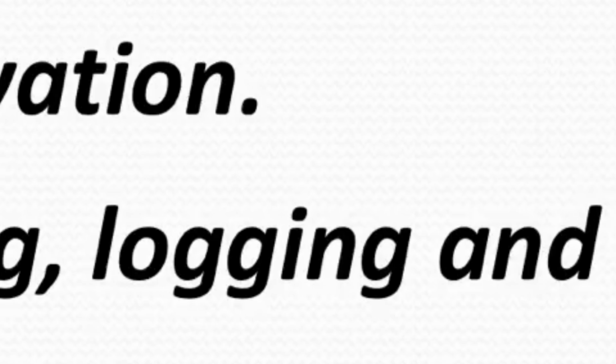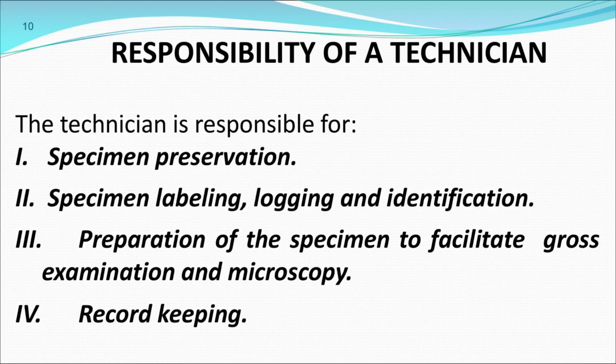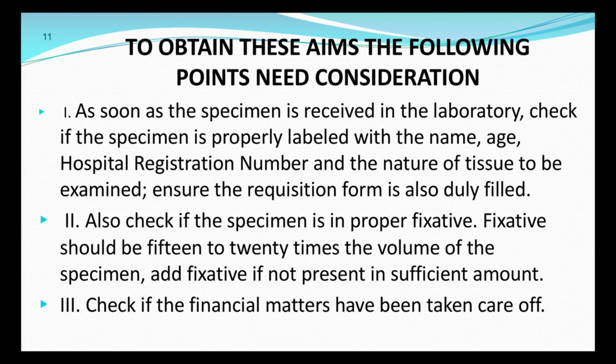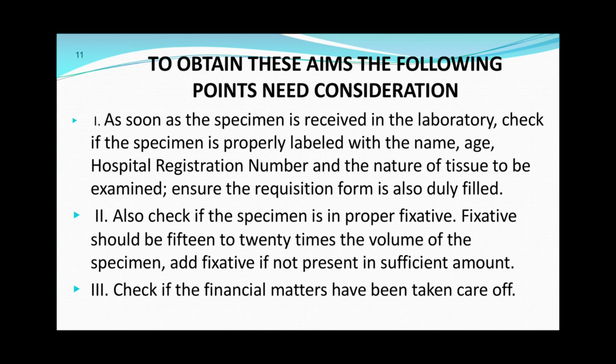Now, what are the responsibilities of a technician? The technician is responsible for specimen preservation, specimen labeling, logging, and identification, and also preparation of the specimen to facilitate gross examination and microscopy. And lastly, record keeping. To obtain these aims, the following points need to be considered.